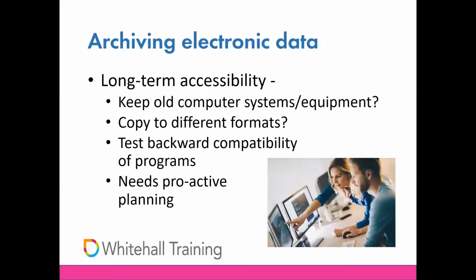Archiving electronic data. The lab needs to ensure that the data remains usable over a long period of time. That's a matter of years. Now, when you think about how quickly technology develops, you realize that this is quite a challenge. How many people nowadays have got the necessary kit to play a Betamax videotape or a Laserdisc or an 8-track cartridge?